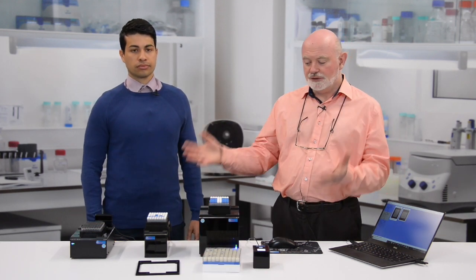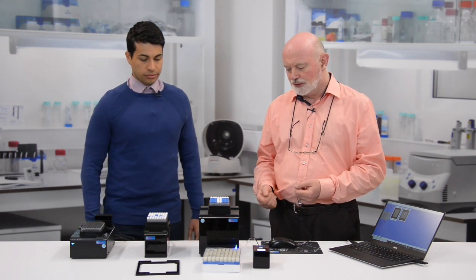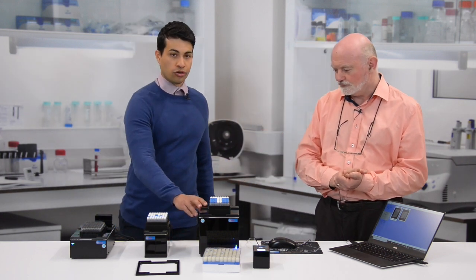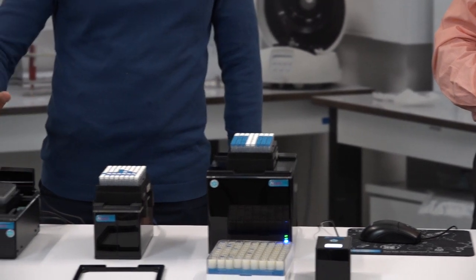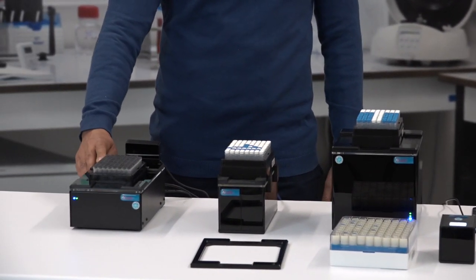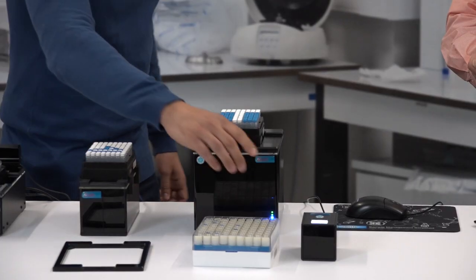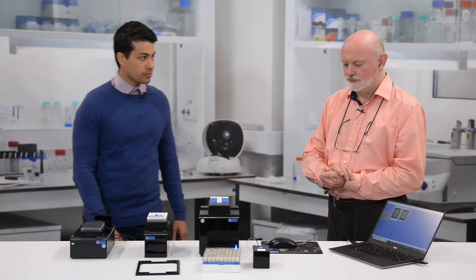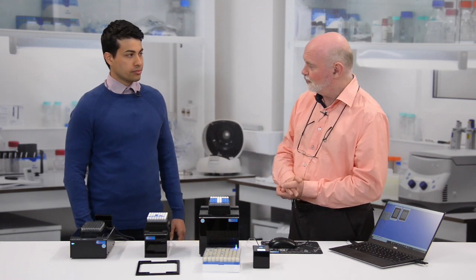Here in the lab today we've got three different models for you to see in this short video: the Cube scanner, the Express, and the Mirage. You've also got the small device here — this is our single tube device for scanning individual tubes, which is very useful if you just need to get a quick barcode from one sample.